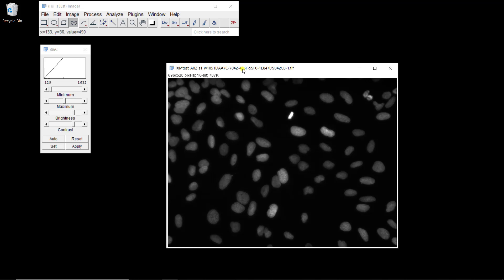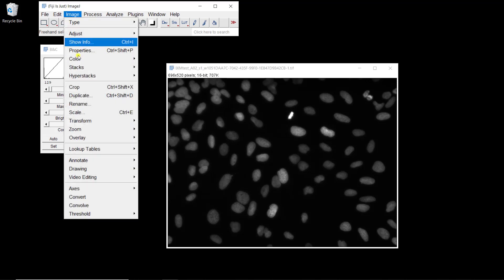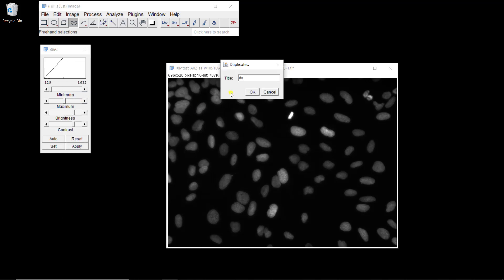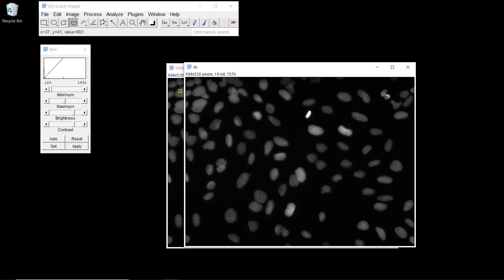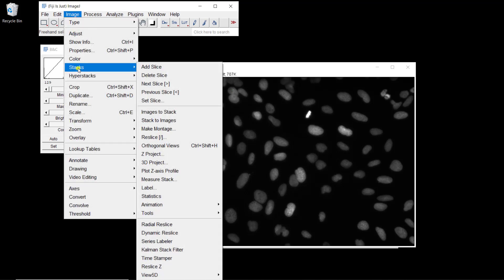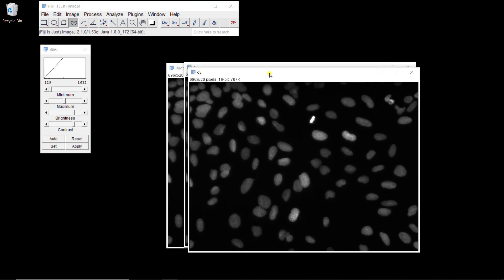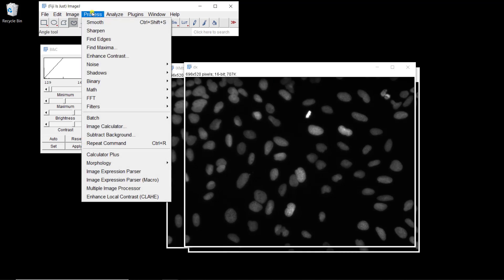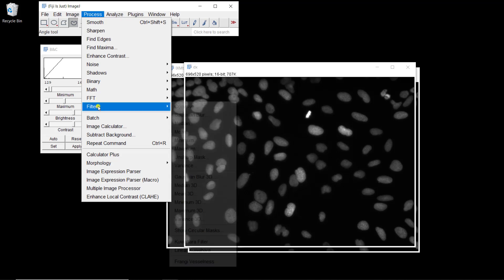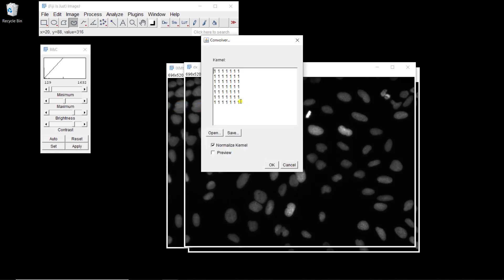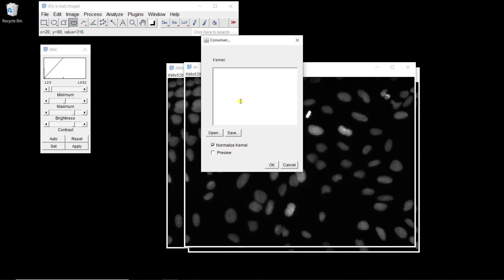I'm going to duplicate the image twice — one for the derivative in X and one for the derivative in Y. First, we need to change the type to 32 bits, because derivatives can be negative and on 16-bit images we'd only get positive values. Now I can duplicate: one for dx, one for dy. Let's start filtering the dx image — Process > Filters > Convolve.